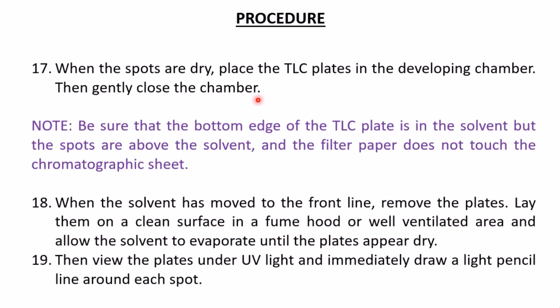Now, when the spots are dry, place the TLC plate in the developing chamber. Gently close the chamber. Now, be sure that the bottom edge of the TLC plate is in the solvent, but the spots are above the solvent. This is basically to make sure that your spots don't end up being dissolved in the solvent, right?